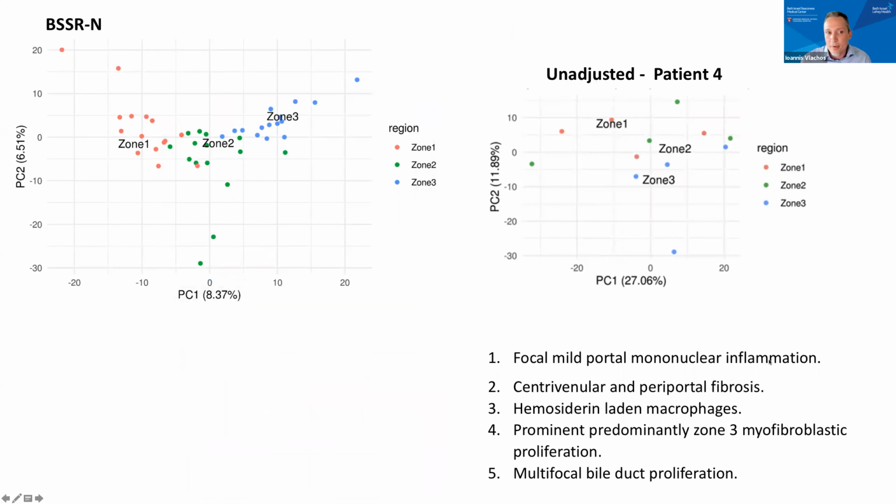As an anecdote, while Nicholas was developing the method for normalization, there was a specific patient that seemed to need a little bit stronger modeling to iron out. And of course, as the bioinformatician's reflex is, yes, let's increase a little bit the stringency and this signal will go away. But having domain experts and the ability to do in situ work, we worked with the chief of hepatopathology of BI, and with spatial stains, we saw that no, this is real. It's real signal. It shouldn't be ironed out, and we're happy that the method is sensitive enough to pick it up. There was a very strong phenotype for that patient, which we followed up with pathology.